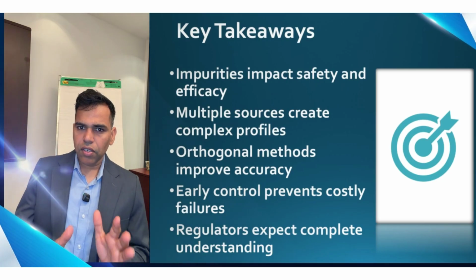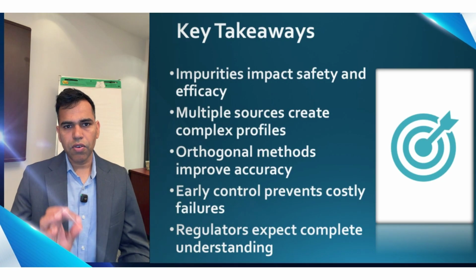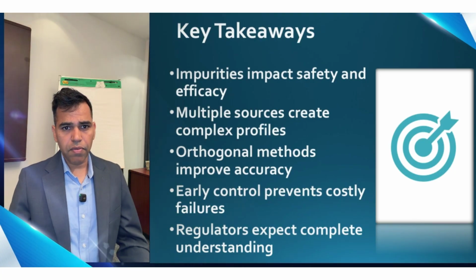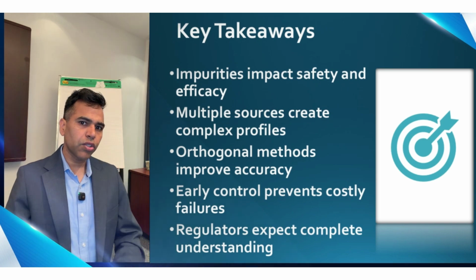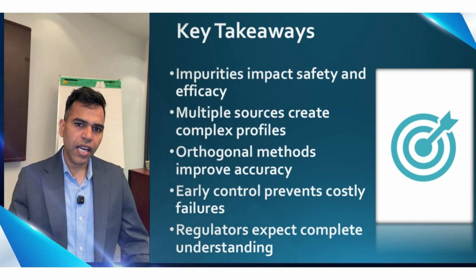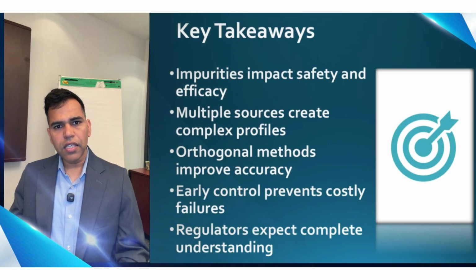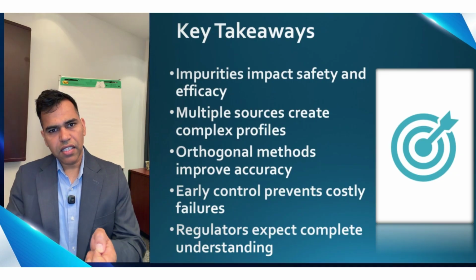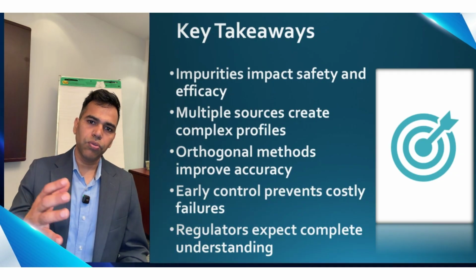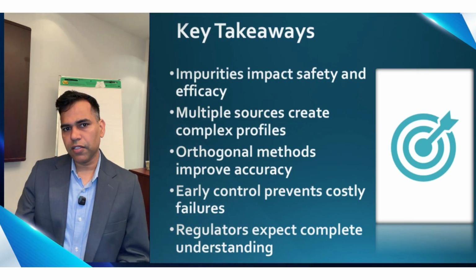The practical conclusion is this: impurity profiling for peptide-oligonucleotide conjugates must be integrated into the analytical development plan from the beginning, not retrofitted after scale-up, and not assembled reactively when a regulatory query arrives. Early systematic characterization is what separates programs that move predictably through IND enabling studies from those that face avoidable delays.